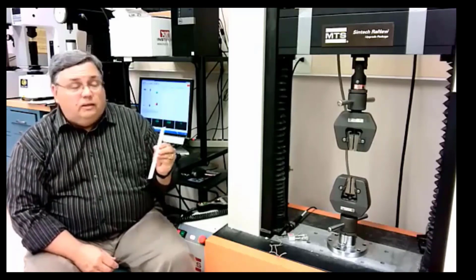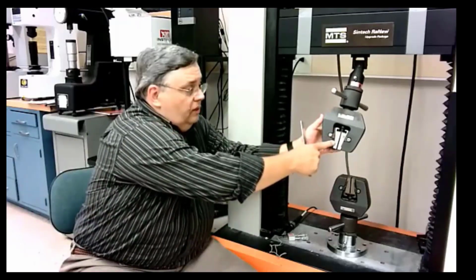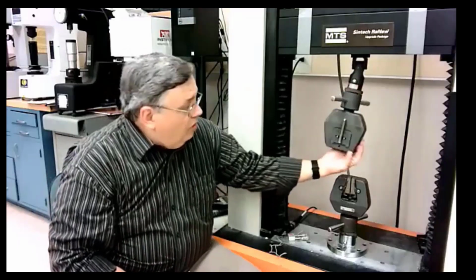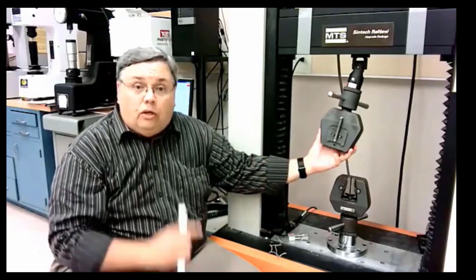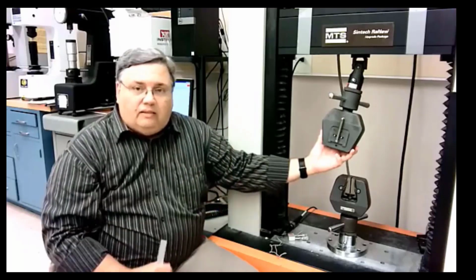Okay, now that we have our software set up and our sensors calibrated, it is time to install the specimen into the grips. You can see the jaw here has a bit of a taper to it. So as the specimen is pulled downwards, that will self-tighten the jaw. Also, if I flip the grip around here, you can see there's a backing plate on it. We're going to use that to ensure that the specimen is vertical. So we're going to put one edge of the specimen flush against that backing plate.